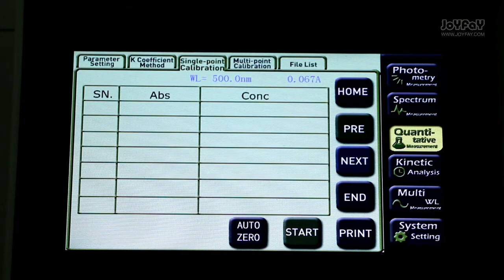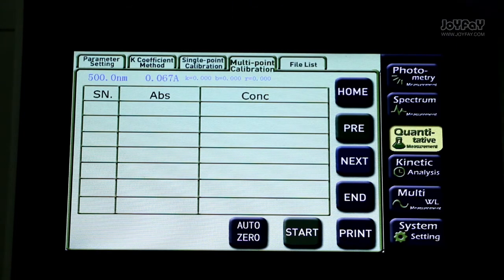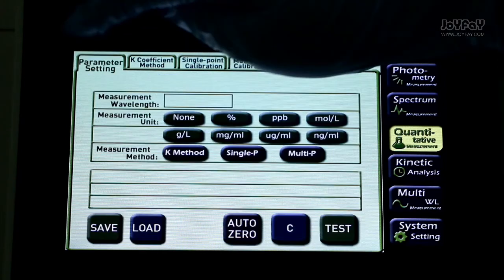Let's come to parameter setting. Enter the value in the input box on the right of the measurement wavelength.